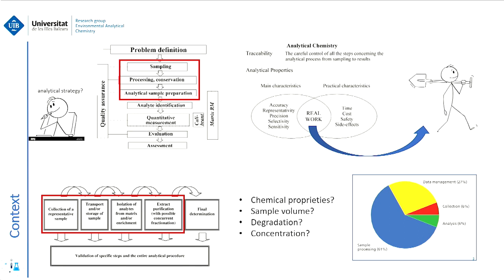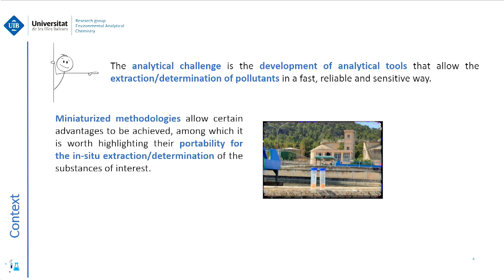For this reason, the analytical challenge is the development of analytical tools that allow the extraction and determination of pollutants in a fast and sensitive way. Miniaturized methodologies allow certain advantages such as portability and in-situ extraction or determination of the chemical substance.